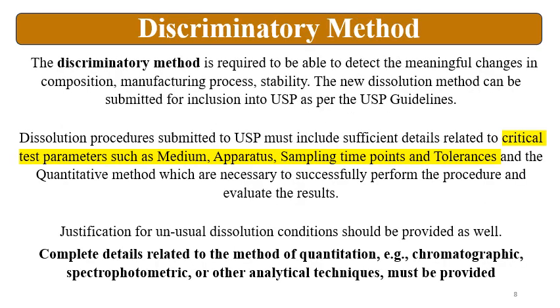product. Then coming to the discriminatory method, this is the method which is able to detect meaningful changes in the composition, manufacturing process or shelf life or age of the formulation sometimes. The new dissolution method can be submitted for inclusion into the USP as per the submission guidelines given by the USP.